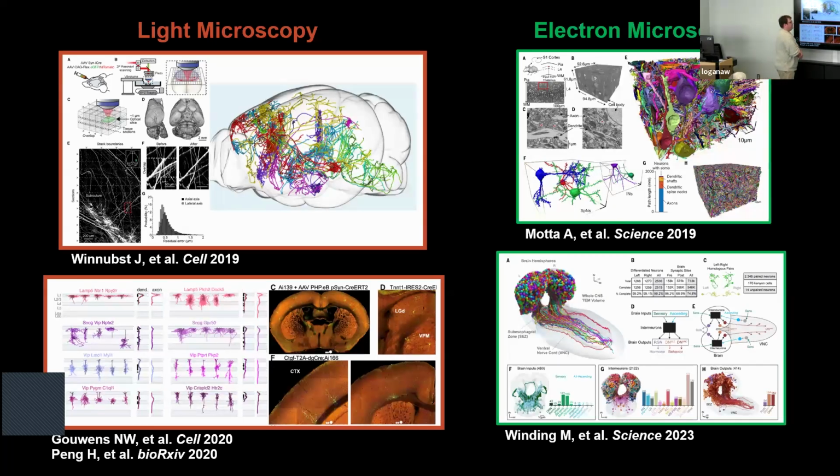Through that, there have been many successful studies that have reconstructed very dense networks. Here, these little things that look like balloons, each one of those is actually an individual cell of the Drosophila brain that is being represented there. And up here, this is a piece of somatosensory cortex in the mouse brain. You can tell from that cube projection that it's very, very dense. You can see all of the cells that are in that volume, right?